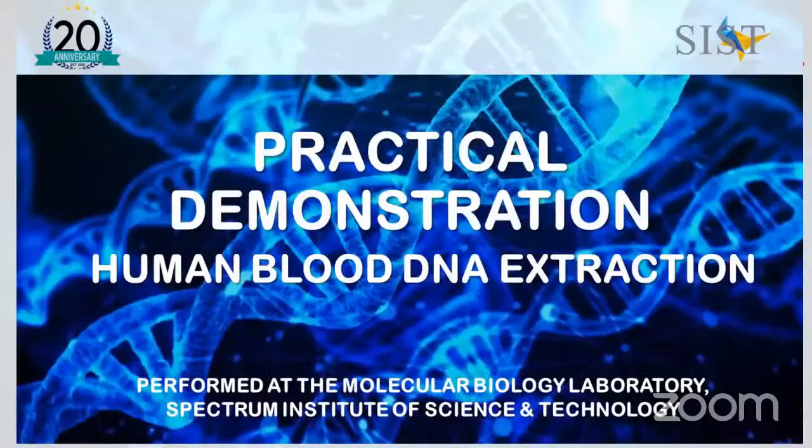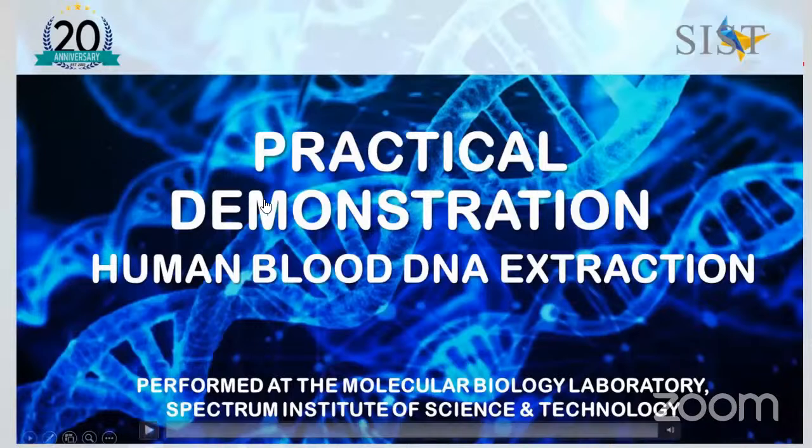So this is about the DNA extraction, the basic protocol. The basic protocol can differ according to different DNA sources. It wouldn't change much, but there will be a small addition of certain steps so that it will enhance the DNA extraction from a certain DNA source. So now we can see a demonstration on human blood DNA extraction, which took place in our Spectrum Institute of Science and Technology. All right.